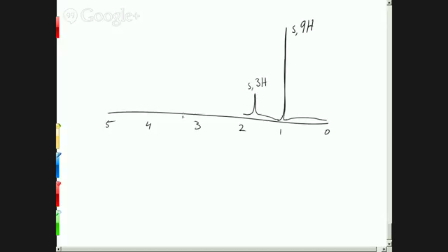And then way over here, between 4 and 5, we have 2 little doublets. So doublets meaning like that. Like that. Same place. I'm just redrawing the one in the book here.